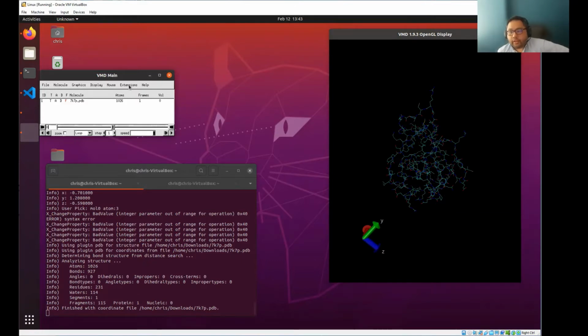To do that, though, we need to basically clean up our PDB file. What we need to do is create something called a PSF file, which is a protein structure file. It'll take your PDB structure and create an exact duplicate of it, but if there are any missing atoms or missing bonds, it'll correct any weird anomalies that may be in that file.